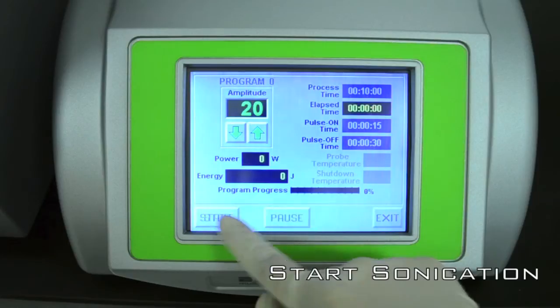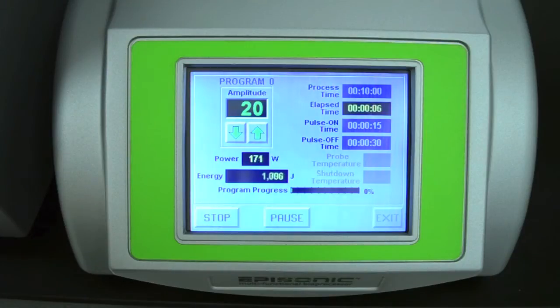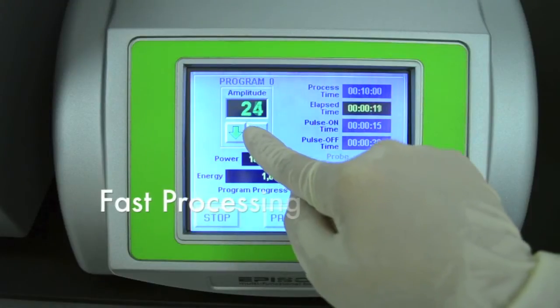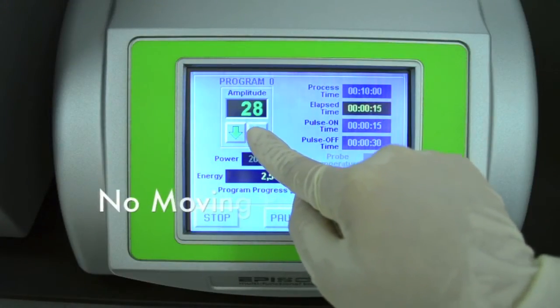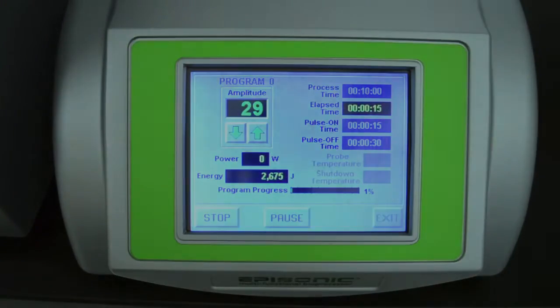Press the start button to initiate sonication. The sonication process will now run. You can shear one or multiple DNA or chromatin samples to the most common fragment sizes for sequencing and ChIP in just half an hour. The Episonic sonication method does not rely on any moving parts, eliminating the risk of mechanical failure.